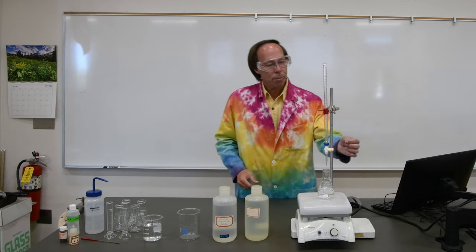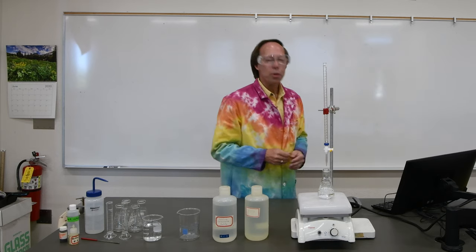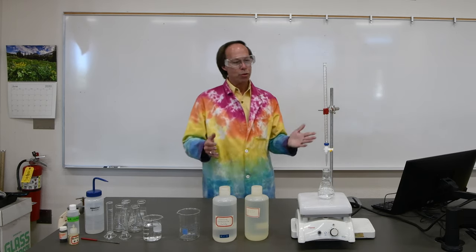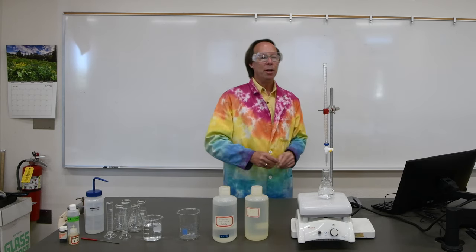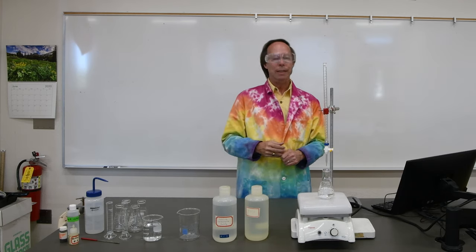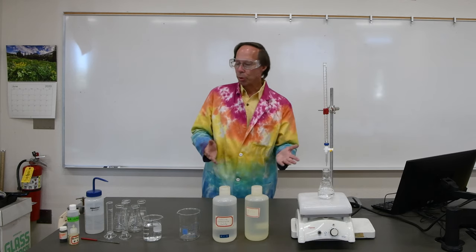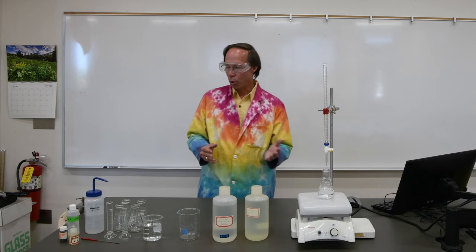What we'll do is we will simply add the known solution of A to the unknown solution of B, and as soon as we've added just the exact matching amount of moles of A, we will stop, measure the volume that we used, and from that we'll be able to calculate the moles of A, and that will tell us, of course, the moles of B. In order to know when the reaction is done, we're going to add something called an indicator. In this particular experiment today, we're going to be measuring the amount of calcium in a sample of hard water.